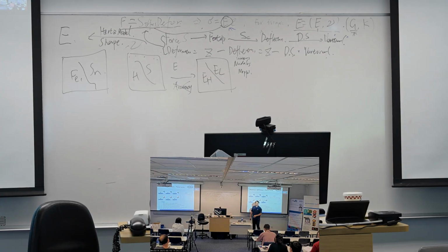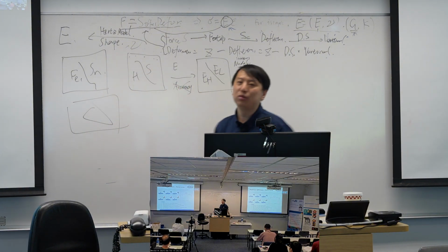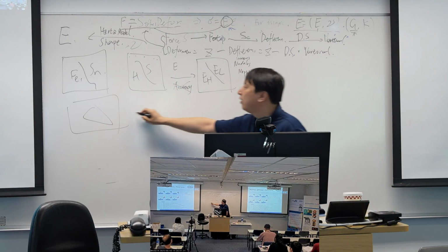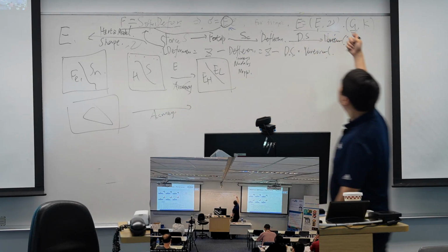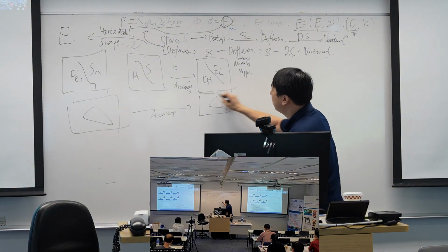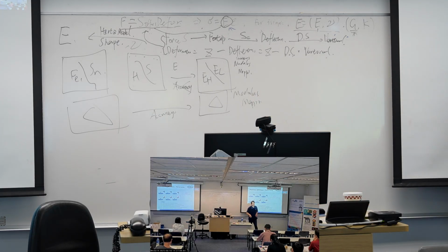That serves your purpose. But as I said yesterday, if you invent a new 2D material and you need to know the accurate modulus of these materials, you need the accuracy. So this calibration is required to be done carefully, and then you can get the modulus mapping, and of course this modulus is accurate.